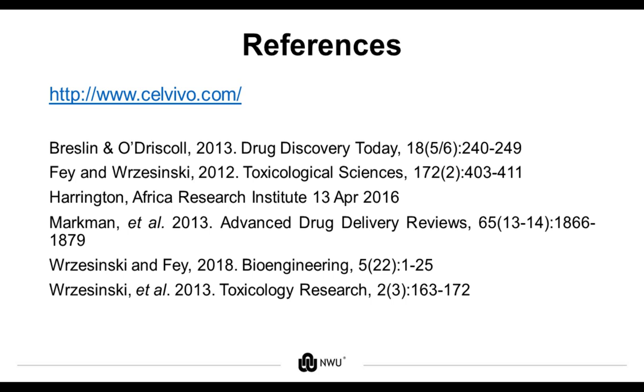Our next question, would it be possible to culture primary cells directly derived from a cancer patient as a spheroid for further personalized medicine application? Yes, it is possible. In fact, primary cultures grown in 2D have a very limited experimental window, as they tend to de-differentiate and lose several key characteristics within, let's say, 72 hours.